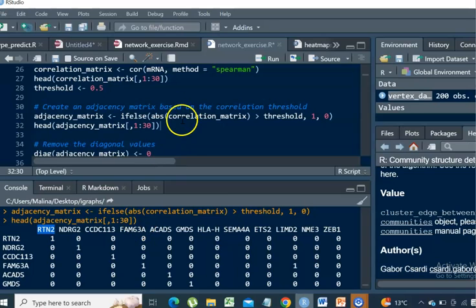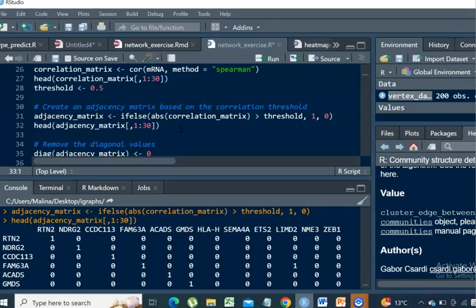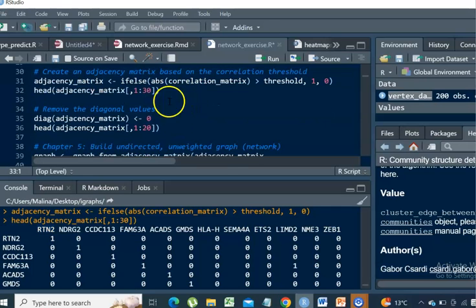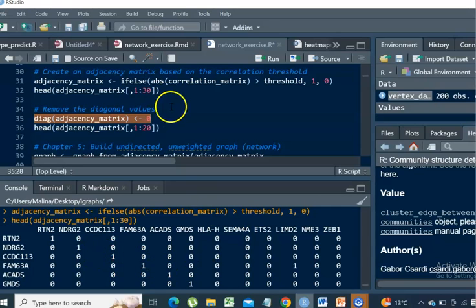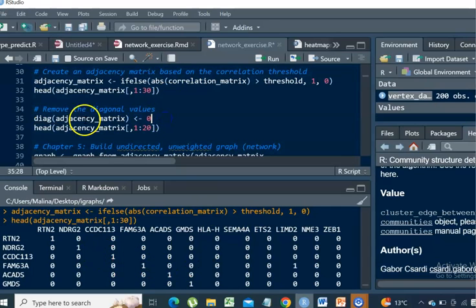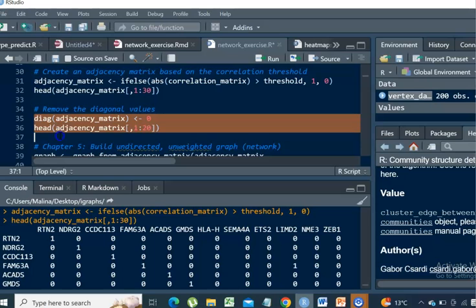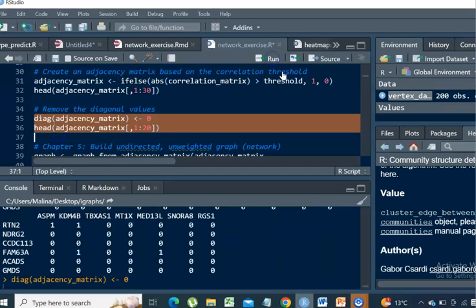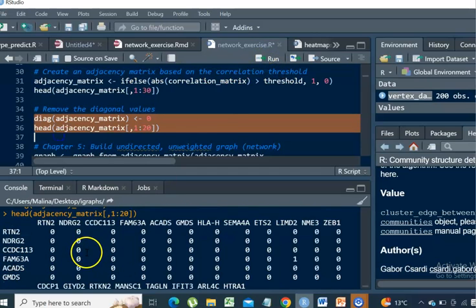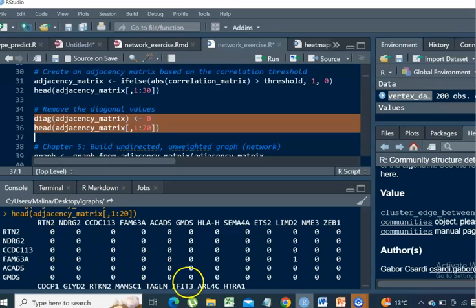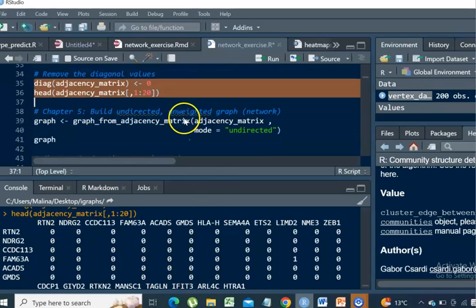However, we do not need that self-interactions further in our analysis when we are creating the co-expression network. So we are going to replace all the values in the diagonal of the adjacency matrix with zero. Let's do that. Now you can see that all the diagonal values are zeros.